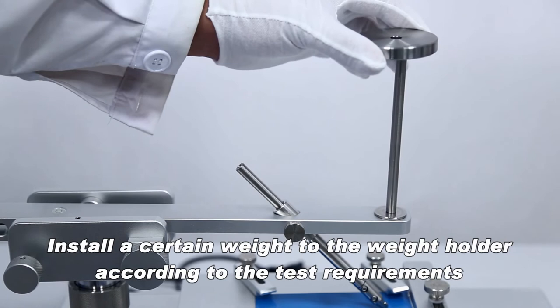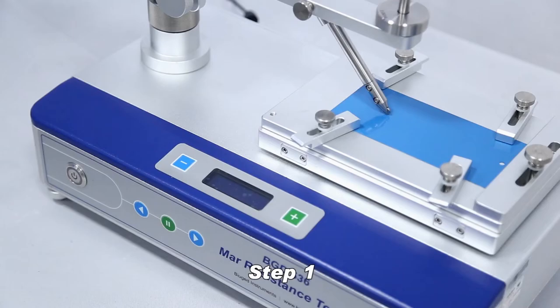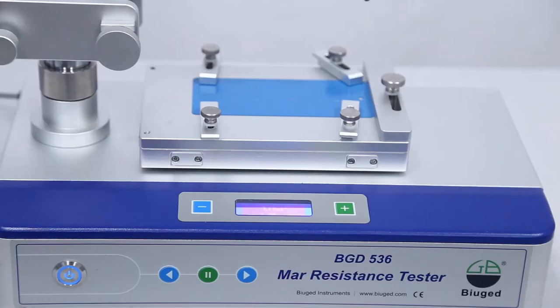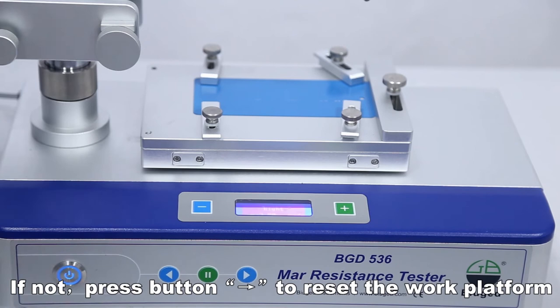Install a certain weight to the weight holder according to the test requirements. Turn on the power switch. Check if the work platform is at the far right; if not, press button to reset the work platform.